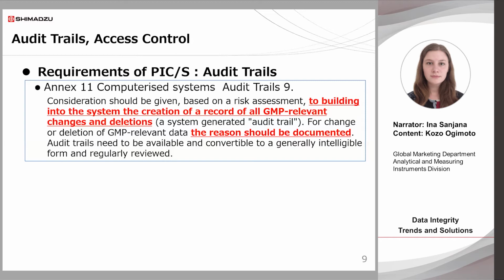Therefore, many recent systems, including our company's analytical instruments, have an audit trail function included. The wording of this requirement, building into the system, indicates that such a system should be utilized. In any case, the audit trail should be correct and complete.